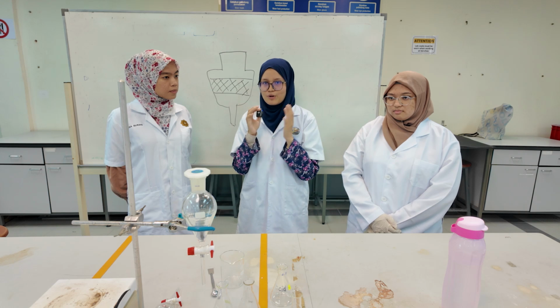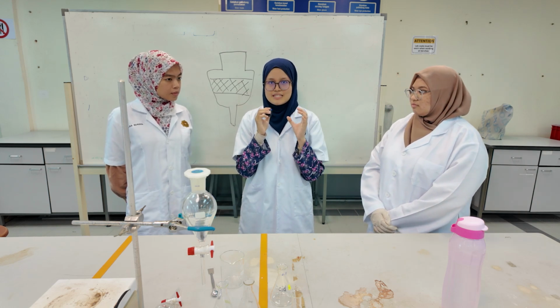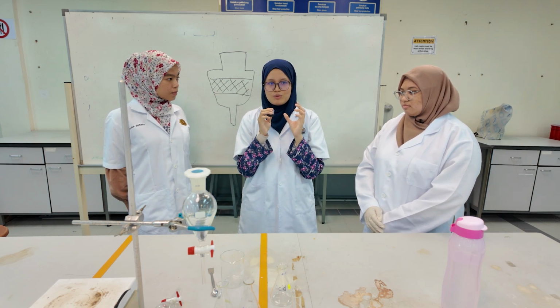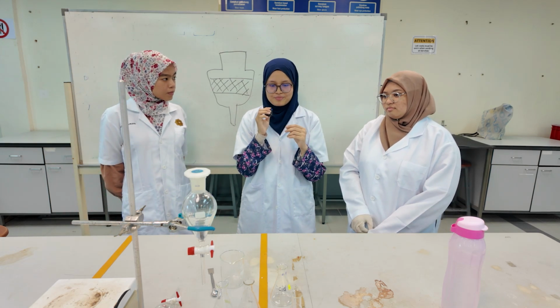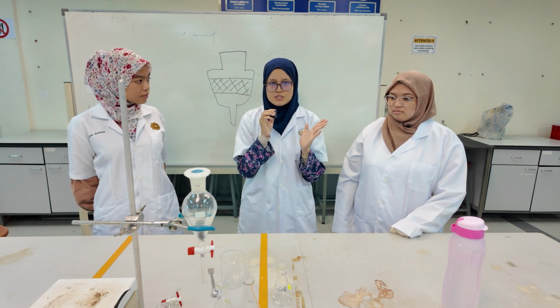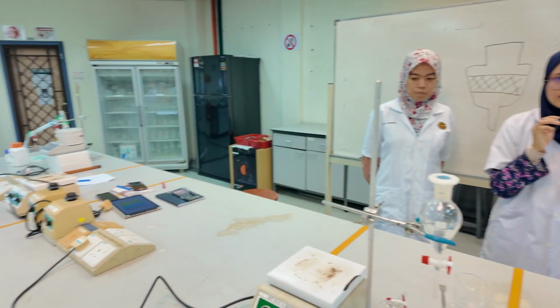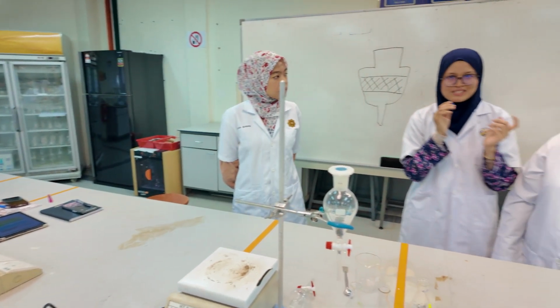To make it easier to understand, let's imagine oil and water. If we mix oil and water together, you will see two different layers, right? It is clearly seen that some substances prefer the oil layer and some substances prefer the water layer. So why do we need to do this? Let's move on to the problem statement.